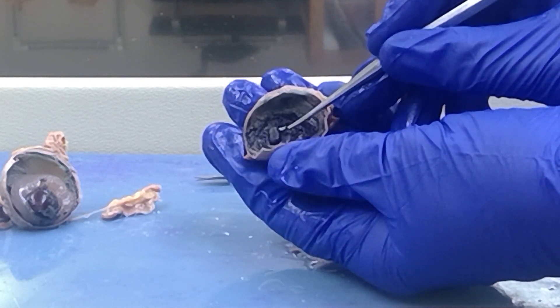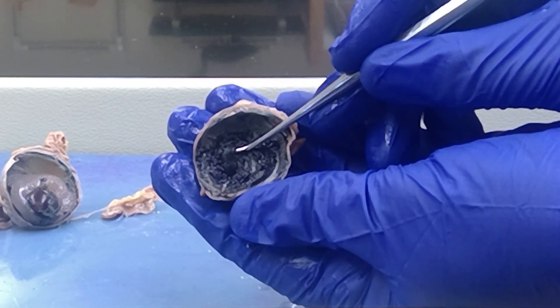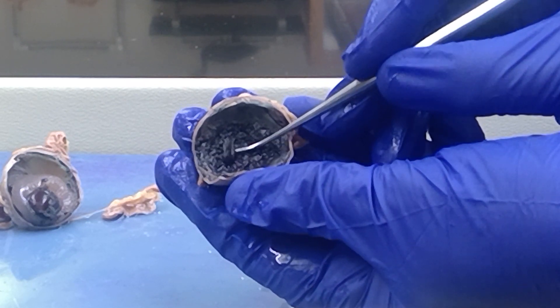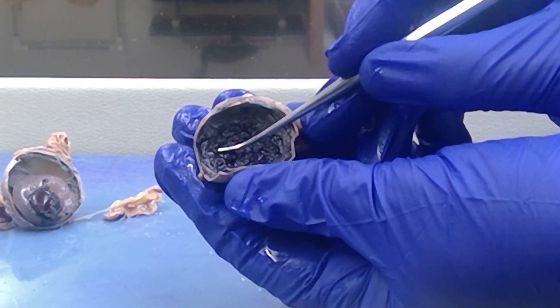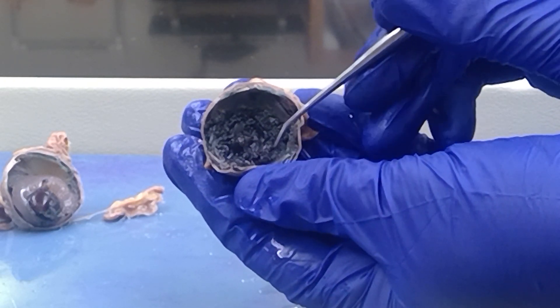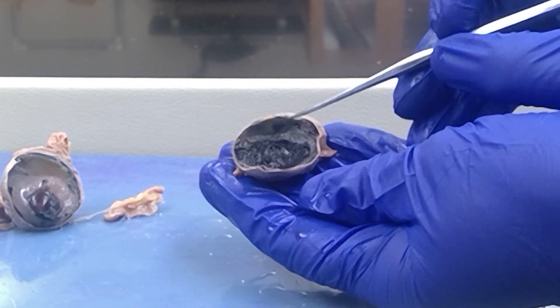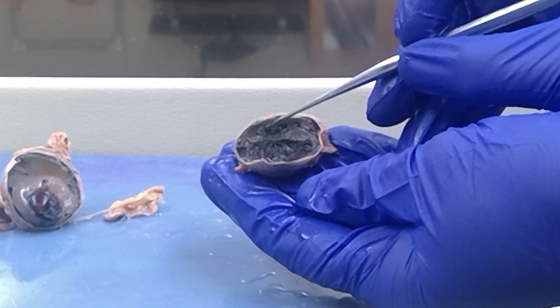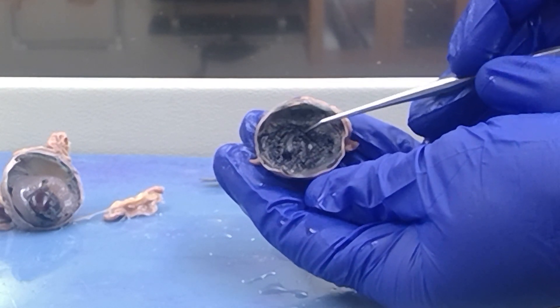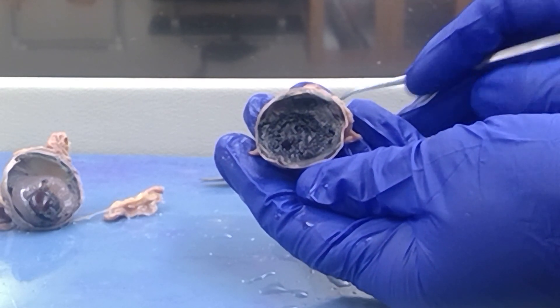This flat structure here that I'm holding up with my probe is smooth muscle, and that's called the iris. The ciliary body is also made up of smooth muscle, but it looks ribbed, like a mushroom cap. Around up here you can see portions of the choroid. The ciliary body and the iris are all part of the vascular tunic.